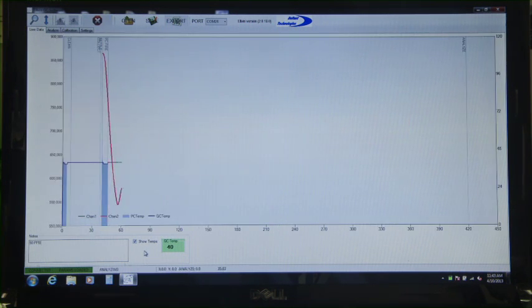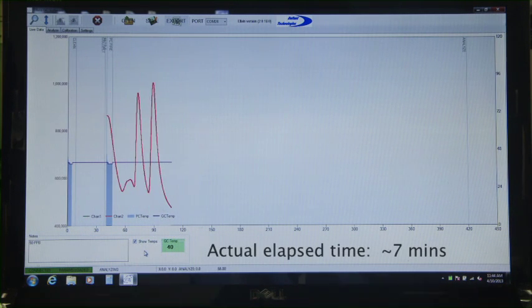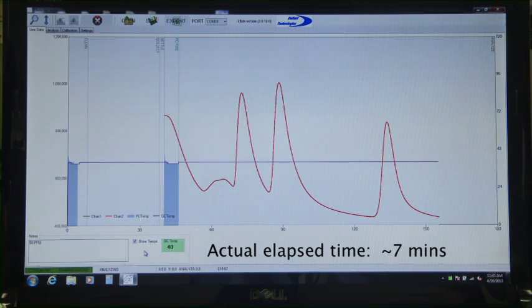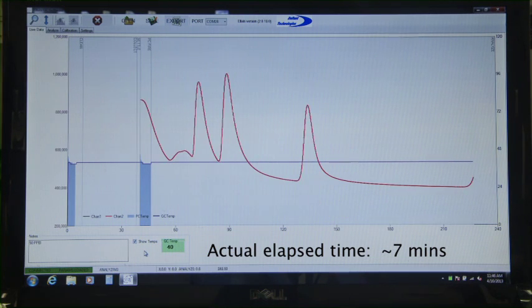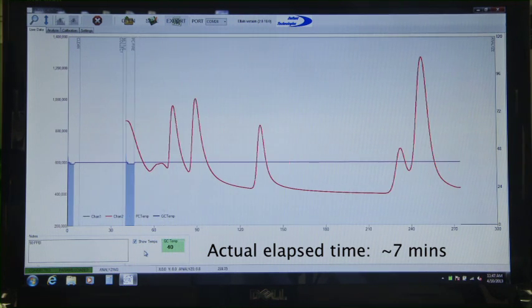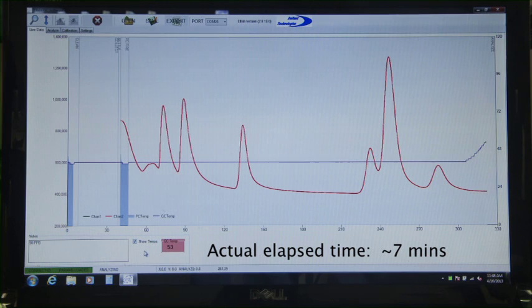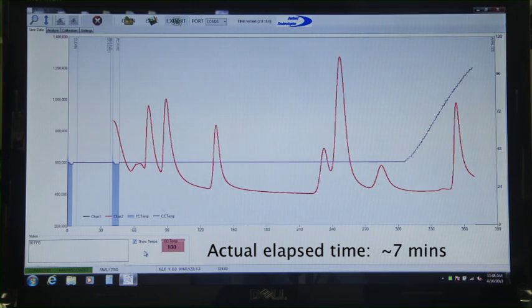As the chromatogram unfolds in the live data window, the peaks for the analytes emerge one at a time. The time the analyte emerges from the column, called the elution time or retention time, is characteristic of the analyte and is used to identify it.